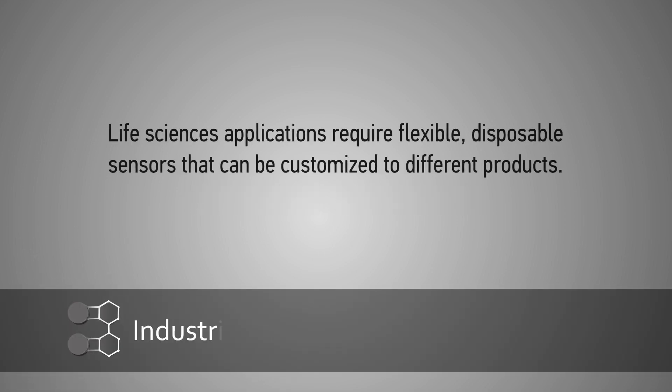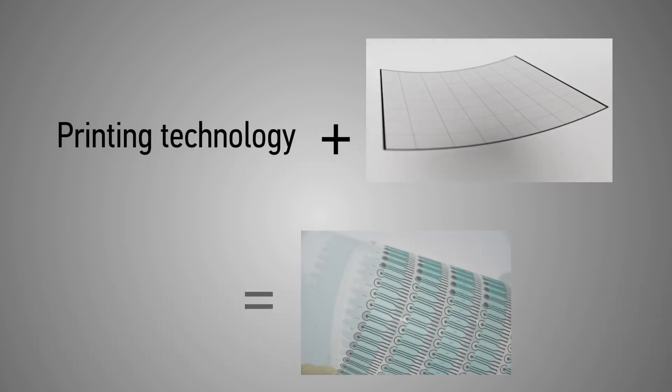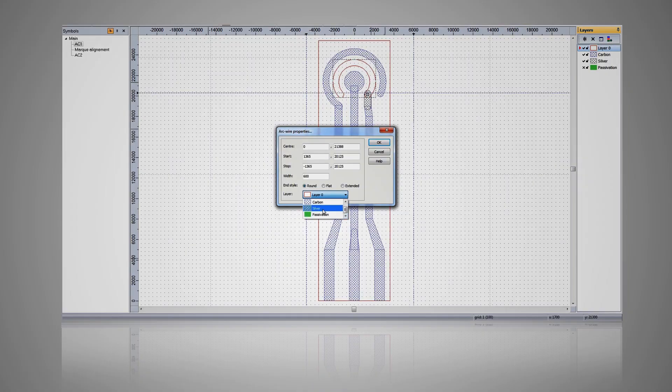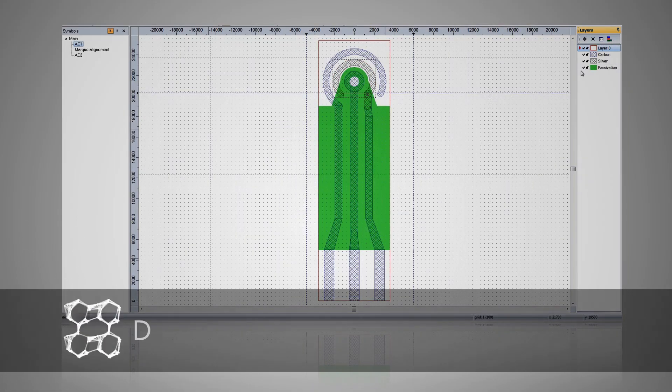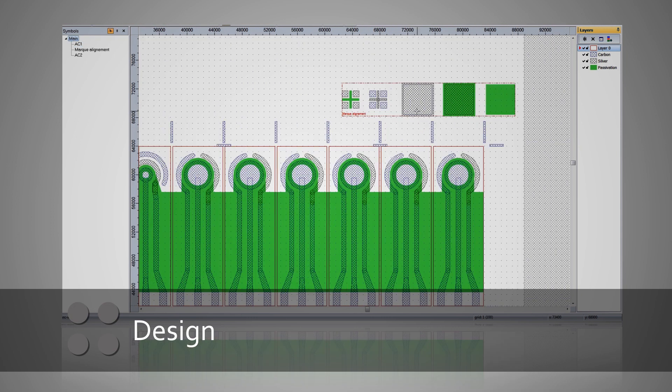Printed sensors for a range of life science applications. The life sciences need customized, flexible, disposable sensors. From clinical analysis to environmental testing and food control, our low-cost sensors meet these industrial needs. Our specialized software is used to design meshes for screen printing. They feature customized properties for functional pastes and are suited to micro-volumes and point-of-care tests.